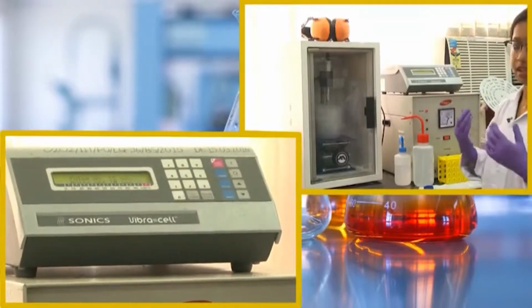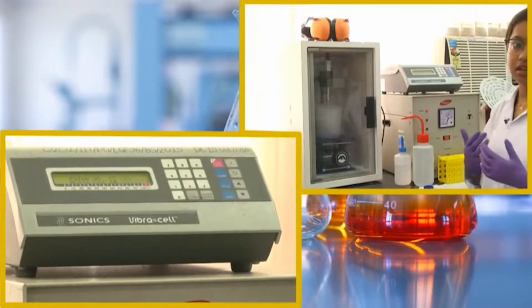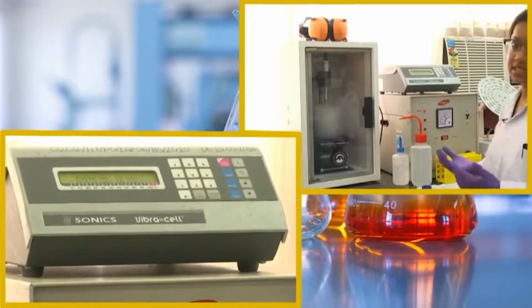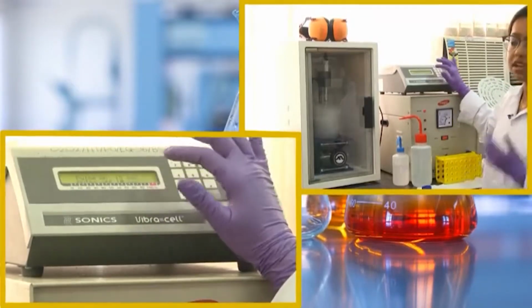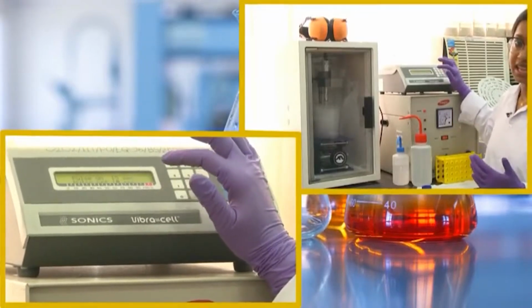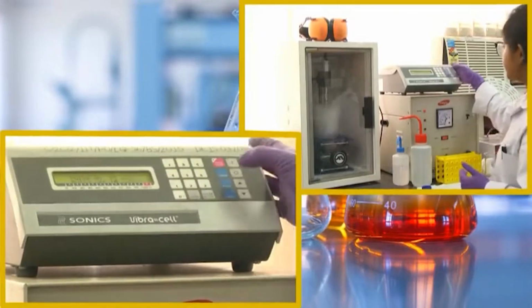So, it will help the sample to cool down so that too much heat does not generate. As we have provided ice, it will lower the temperature of the sample, because when the pulse is on, it will start generating heat, and when the pulse is off, it will stop generating the heat as well as the vibration, and the sample gets the chance to cool down.